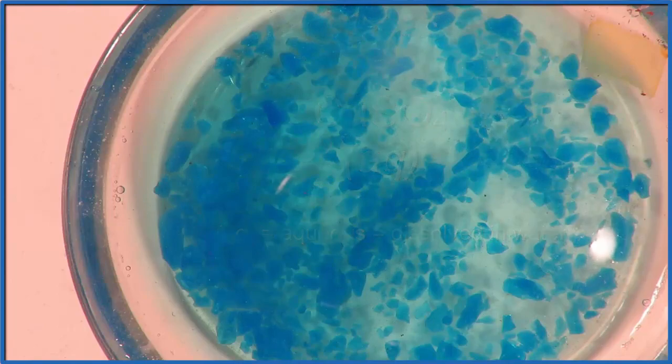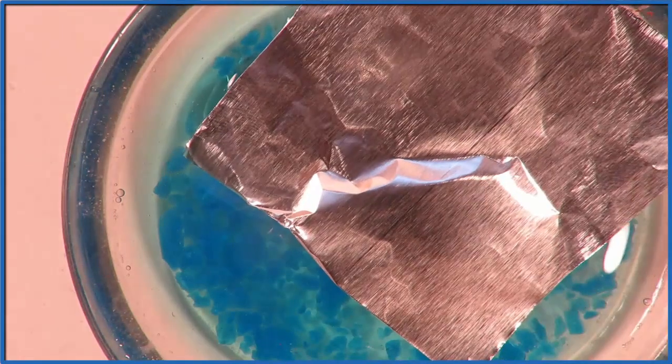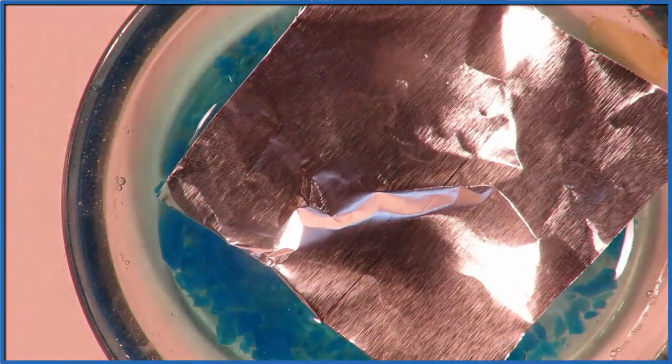We'll get it dissolved a little bit, then we'll add aluminum, and those two are going to react in what's called a single displacement or single replacement reaction.